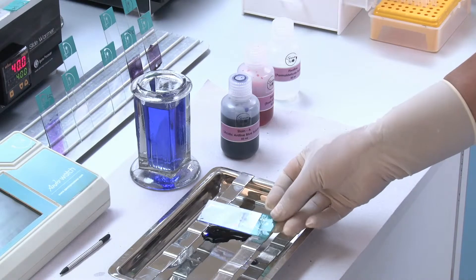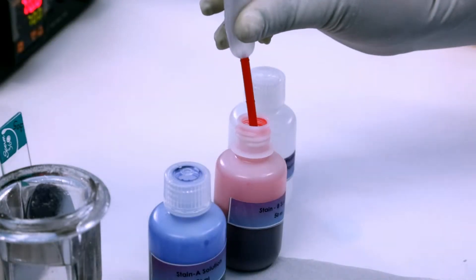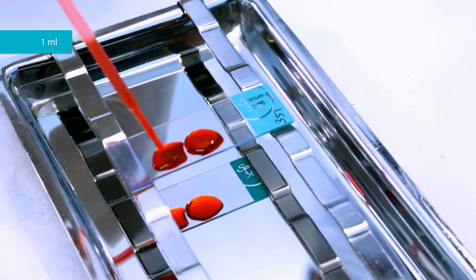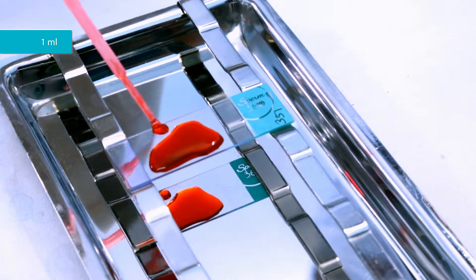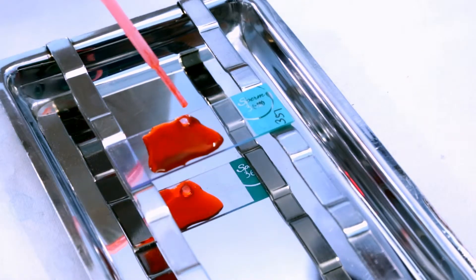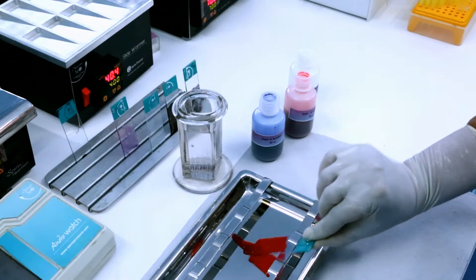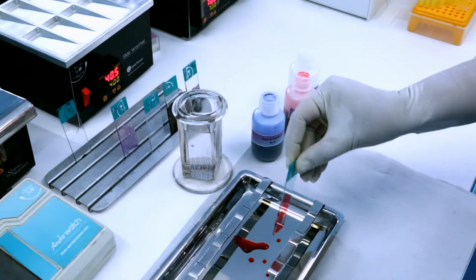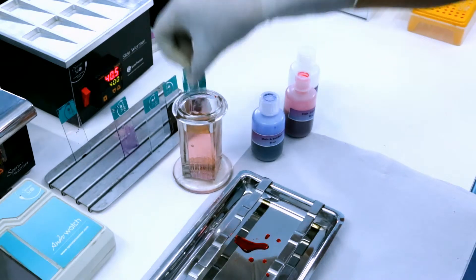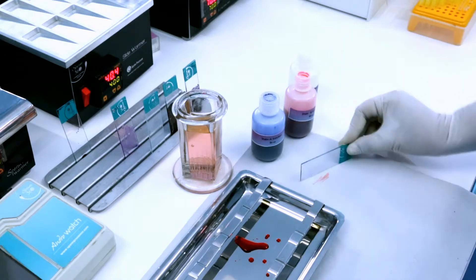Keep the slide horizontally on the staining tray. Cover the smear with stain B. Keep it for the required time. Drain off the stain B. Rinse the smear with distilled water. Drain off the distilled water.